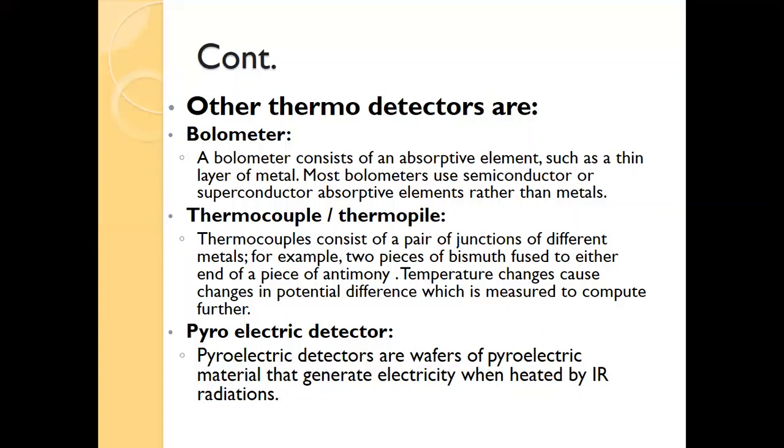Another is the pyroelectric detector. What is a bolometer? A bolometer consists of an absorptive element such as a thin layer of metal. Most bolometers use semiconductor or superconductor absorptive elements rather than metals.